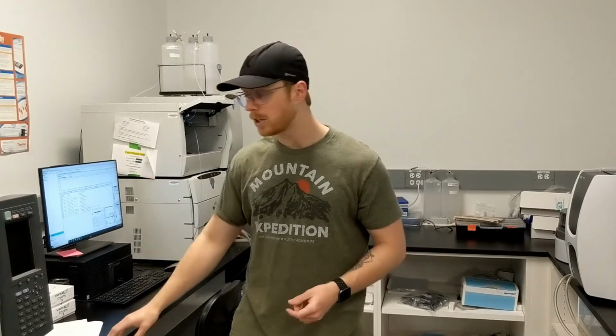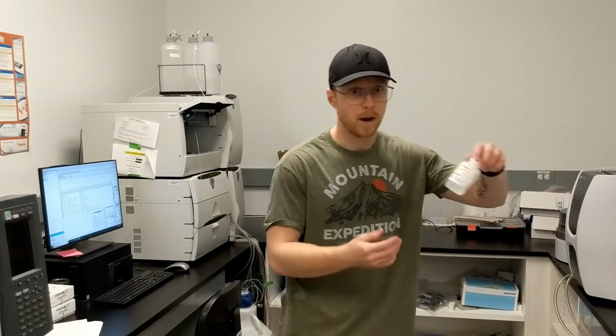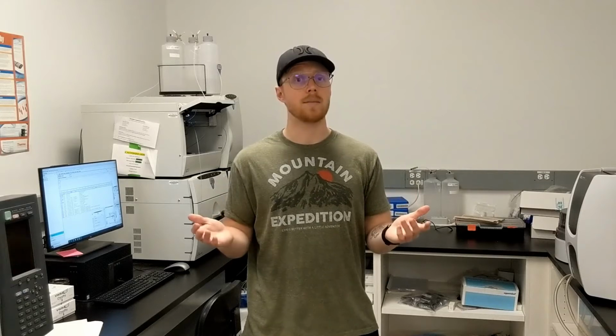An example calibration curve that I make when I'm trying to measure phosphate would be somewhere like 1, 5, 25, 50, and 100 parts per million. And then the other ions, you can just look at the bottle and figure out what concentration those are as well. So once you've got your calibration curve made, now it's time to load the autosampler. Let's see how we do that.